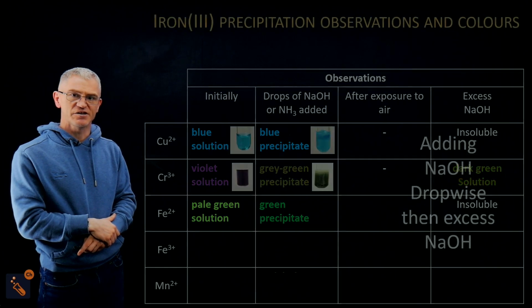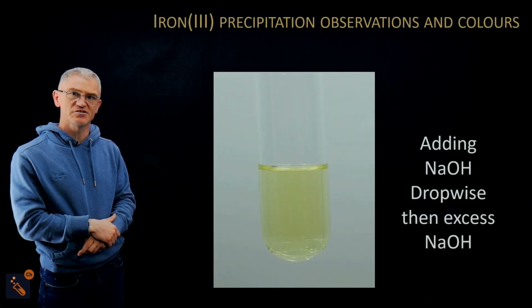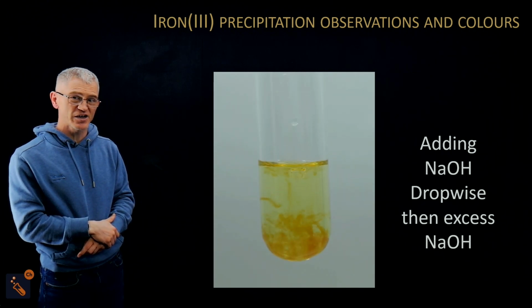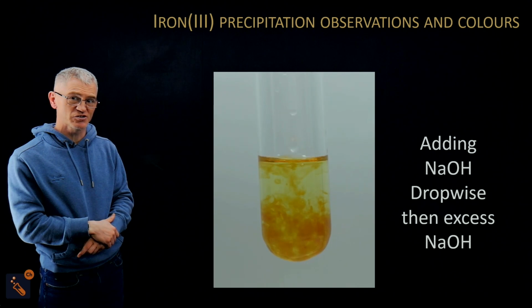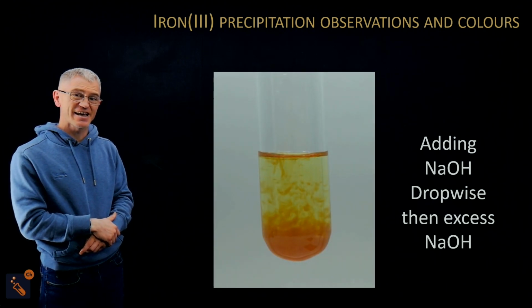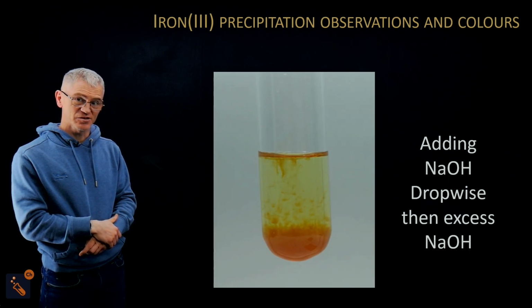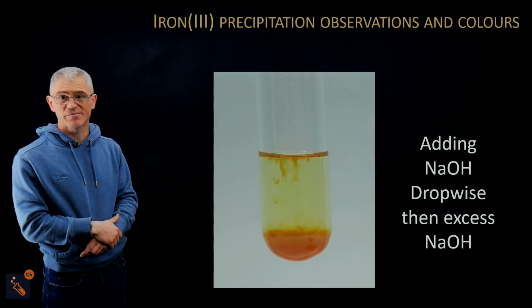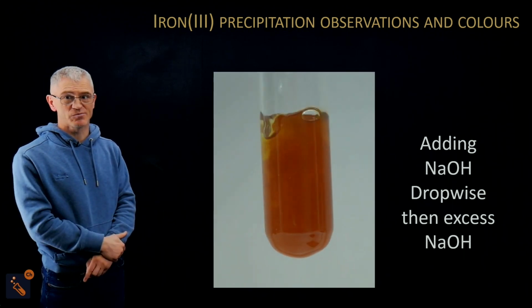And let's carry on to the next one. So adding sodium hydroxide to iron 3 this time. And you shouldn't recognise this goes to that brown colour straight away. Okay, and it goes to the brown colour, and then we're going to add excess sodium hydroxide. And if you add excess sodium hydroxide, all that happens is that you get more of your brown precipitate.